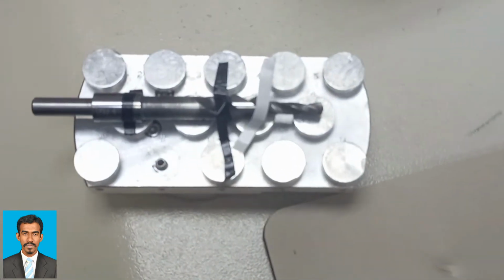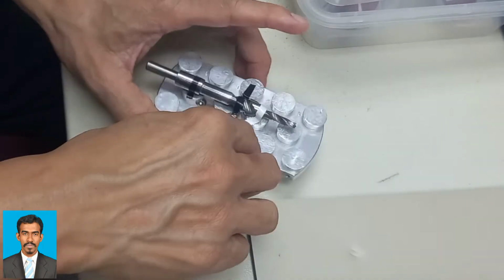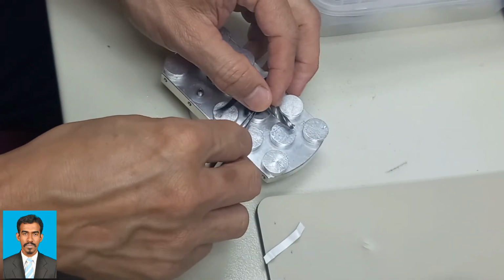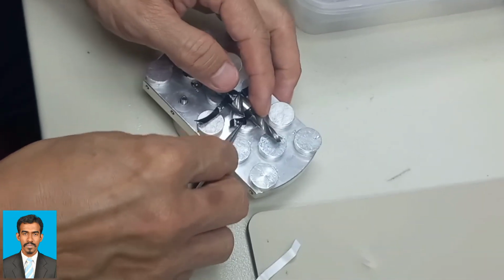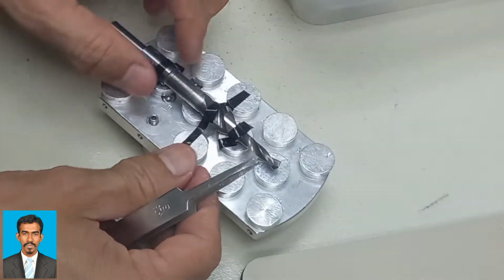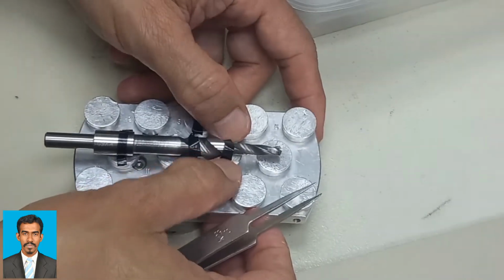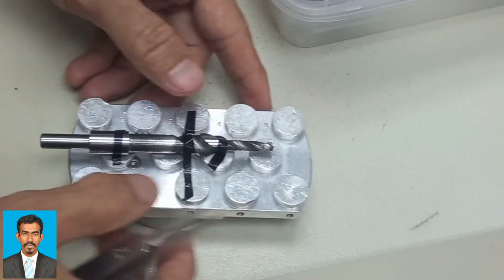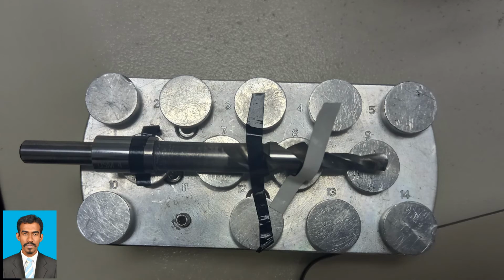Place the sample on the sample holder. This is called a multi-holder since there are multiple plateaus, and any one of these 14 plateaus can be selected in order to bring the plateau to that particular focus position. Usually with the help of tape, we stick the sample in the multi-holder.